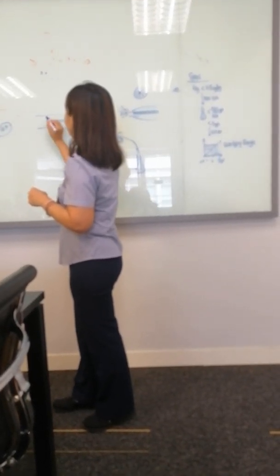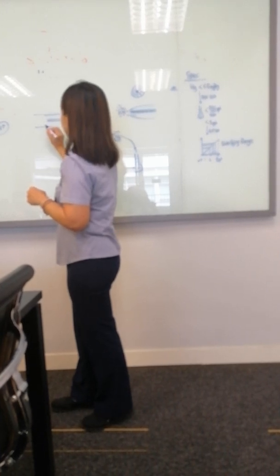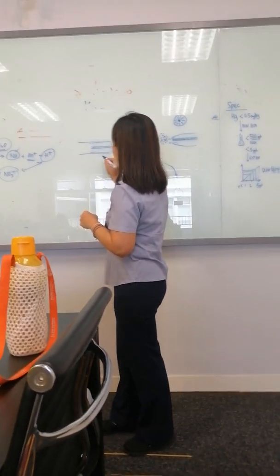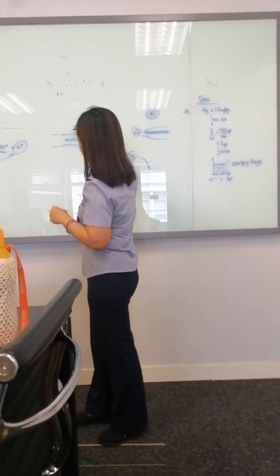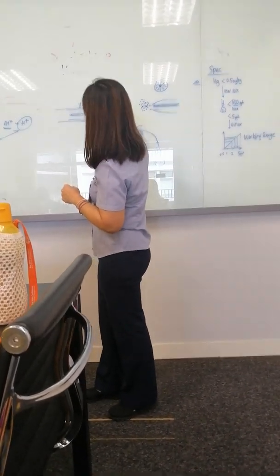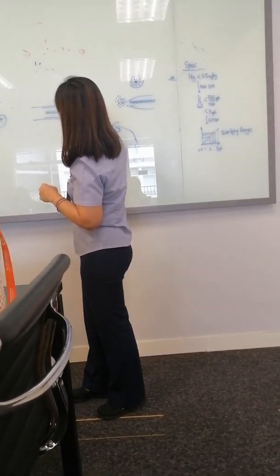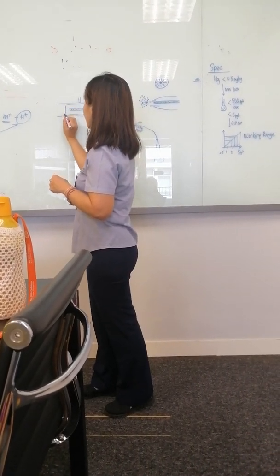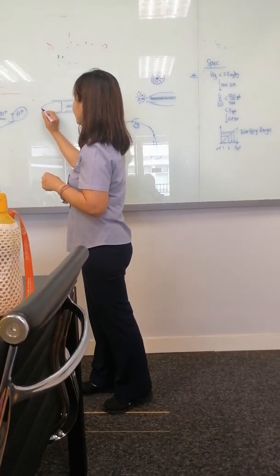Okay, so now I'm going to draw your torch. Actually your torch has two layers. This leg goes into plasma, then this leg goes into auxiliary gas. Yeah? So actually it's like that. So they work like this. Now, whenever you work with plasma gas, it will be like this to create this plasma.